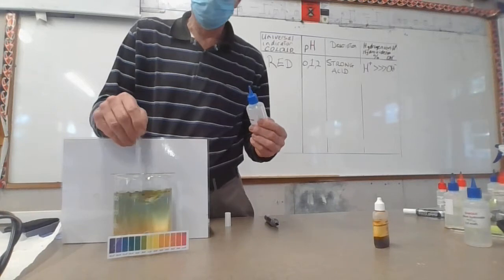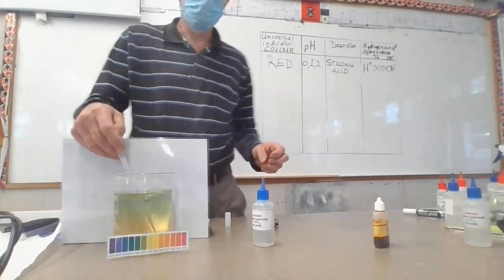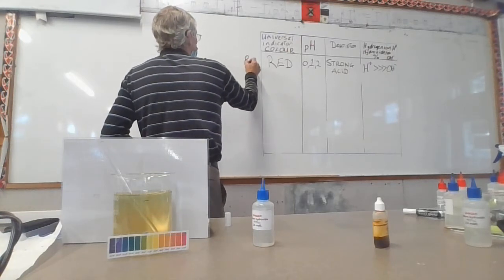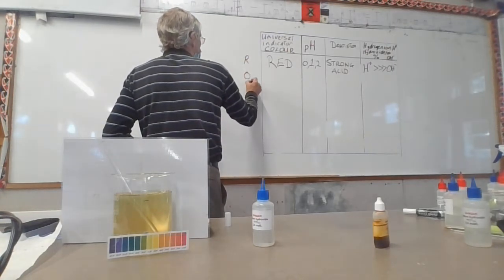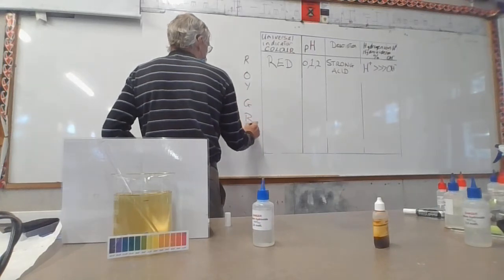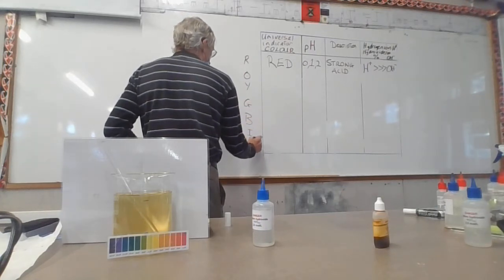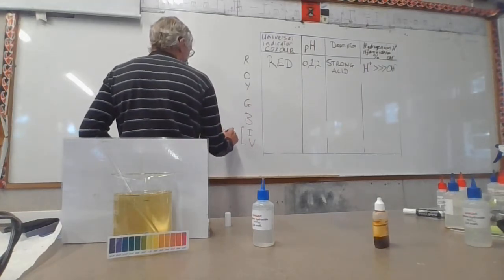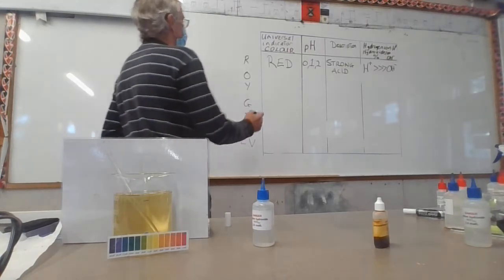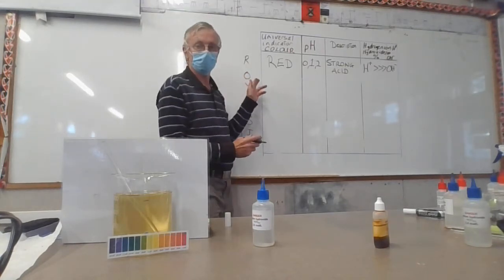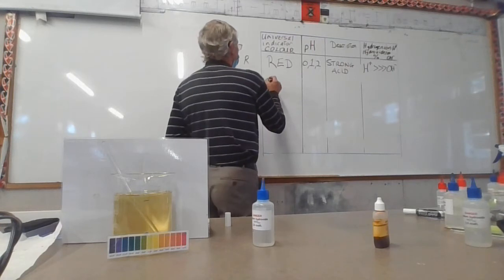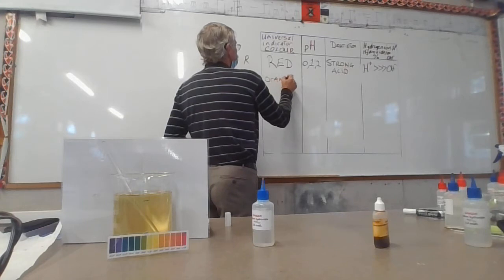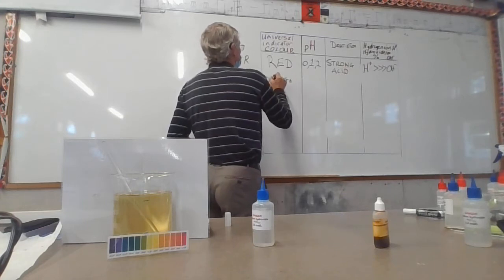It went through orange. Now, the colors of the universal indicator are, of course, the colors of the rainbow: red, orange, yellow, green, blue, indigo, and violet. These two here at the end are purple colors, and in an exam you just refer to this as purple. We've gone from red to orange fairly quickly, shot through the yellow. So orange and yellow.